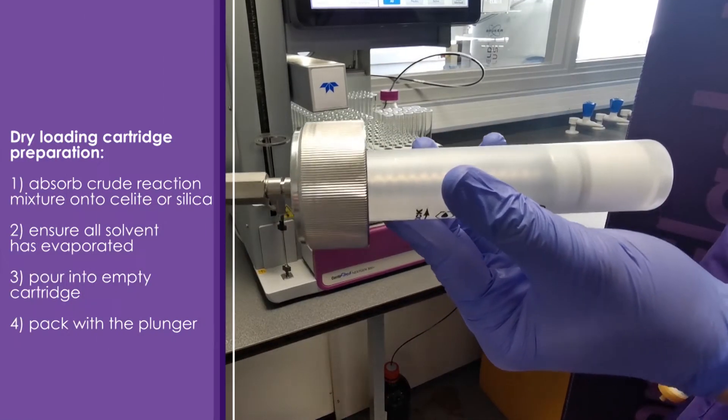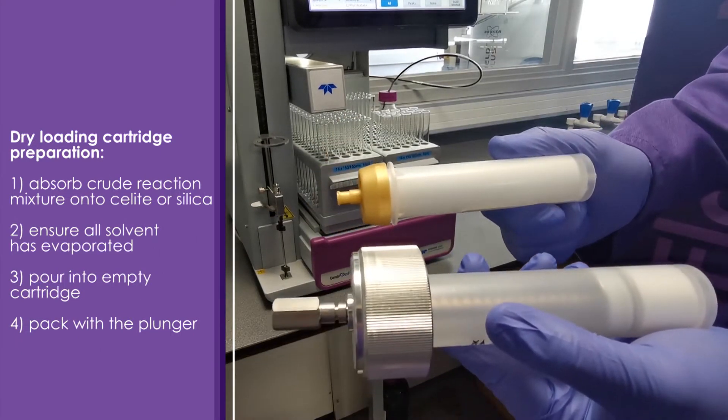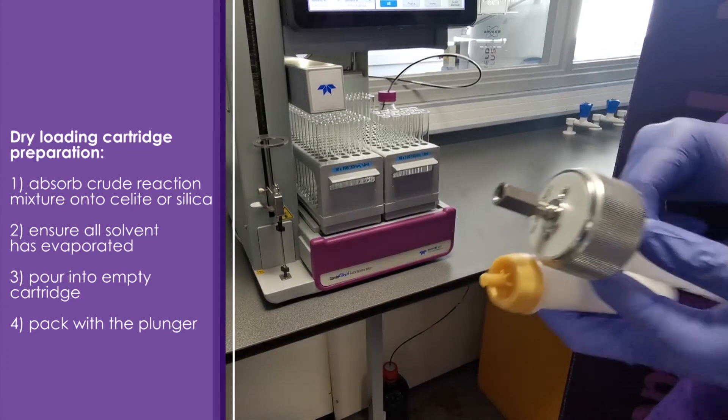Now that we've prepared our dry loading cartridge, all we need to do is load this with our column onto the machine and we're ready to run our purification. So let's give that a go.